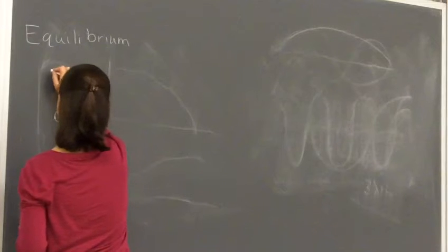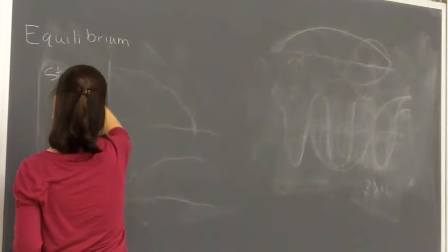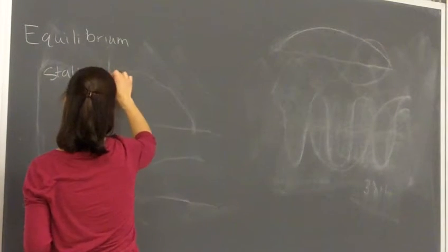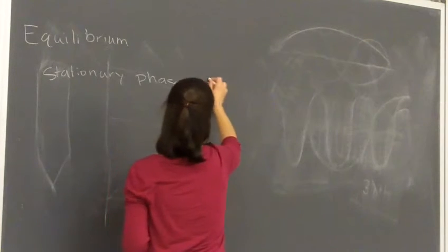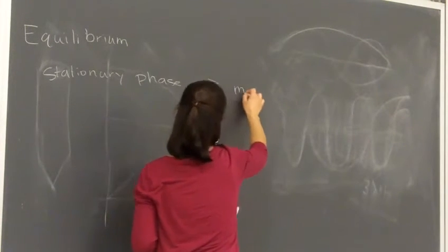You've got on one side the stationary phase, and the other side you've got the mobile phase.